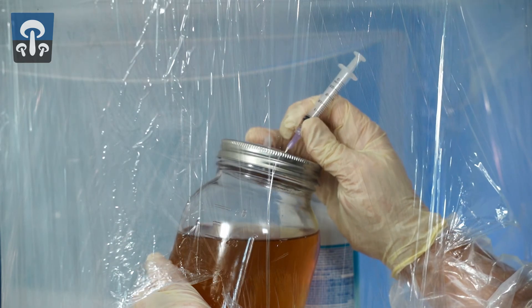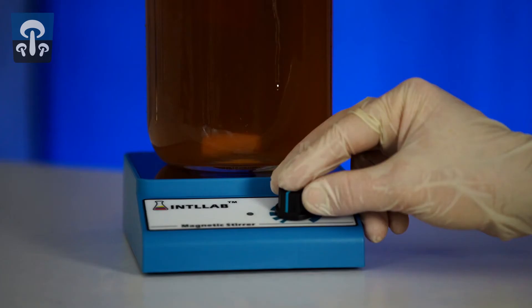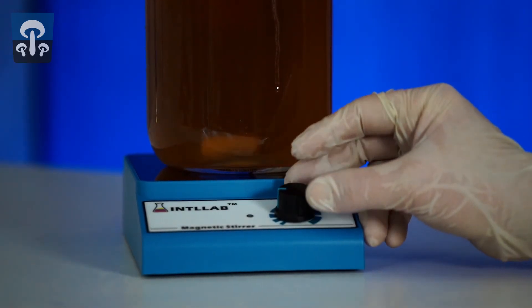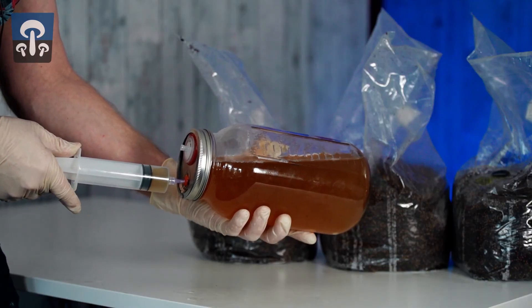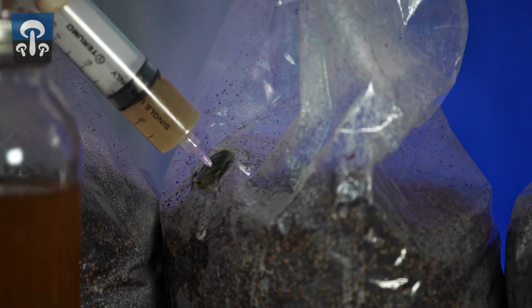Next, pull out the needle and place the jar on the stir plate. Set the vortex to low and allow it to colonize for one to two weeks. The jar is colonized when there's an appreciable amount of snowflakes floating around in the jar. You can suck liquid up into syringes and save them under clean conditions as master syringes, or you can squirt it directly into bags.